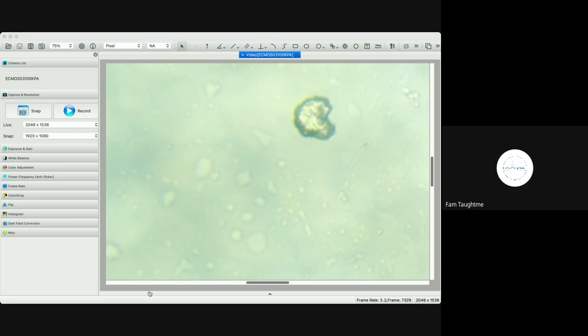If you want to see more examples of it, the YouTube has both the videos, and the videos have hundreds of examples of the different ferning patterns in full size. I really believe that you've got to see this in full screen to really get the look of it. When you're scrolling over it and you're seeing these different forms, it definitely inspires. It inspired me as an artist as well. I thought, wow, this is a medium for art. So I hope to continue making art about this as well, using these organic forms as jumping off points for some of my artwork.